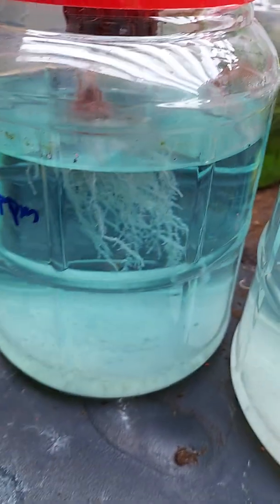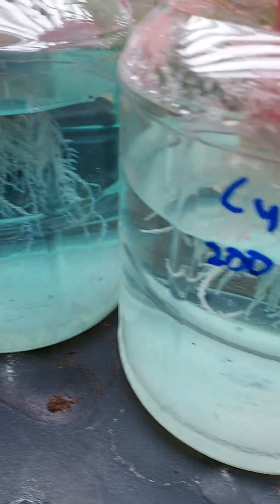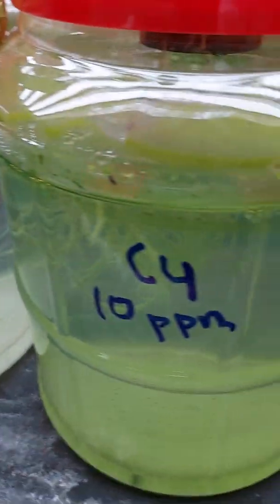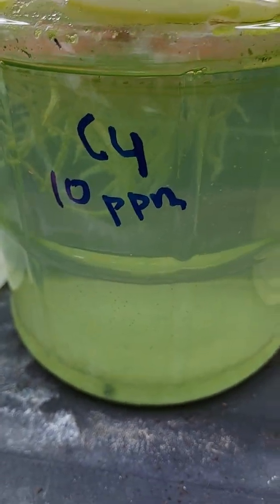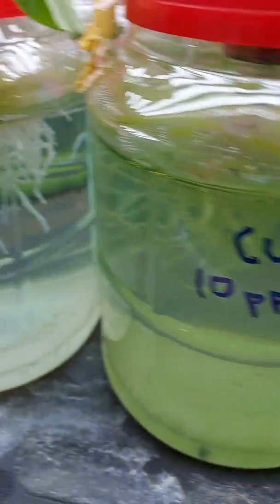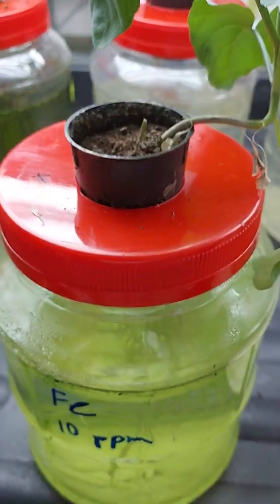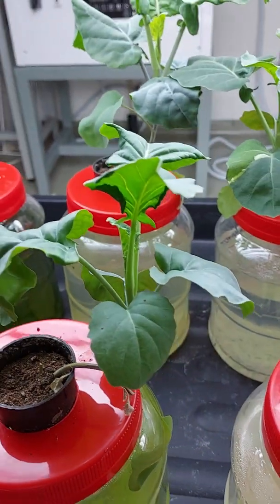Now what's interesting is the morphology of the roots. You can see the roots under the various levels of copper stress. At 10 ppm, they appear to be normal, as well as in the controls. In the case of iron, 10 ppm, normal growth.